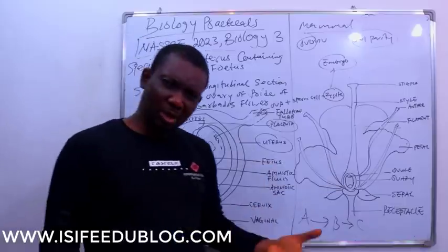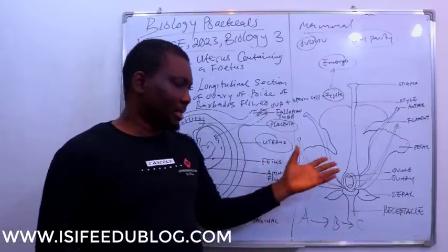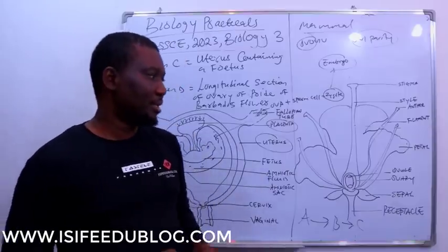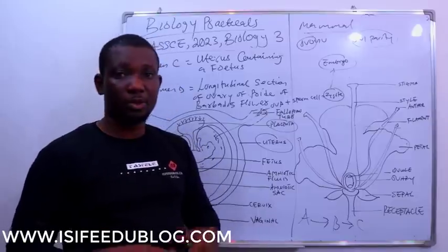So you can see what is the color? It is red. Okay, it's red or pink color. Okay, the color is an adaptation to invite insects for pollination. This is what you observe structurally.